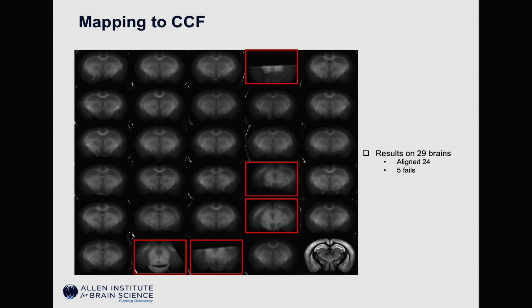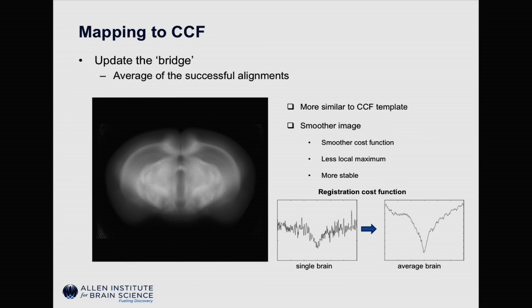We first tested this idea on 29 brains. At the end of the row, it's a coronal section from the CCF template, and at the same location we take one coronal section from each of the registered brains as well. If the registration is good, we should see very similar images. As we can see from these 29 brains, we have about 24 of them registered and we failed on five. This is not bad, but we believe every mouse deserves a meaningful life.